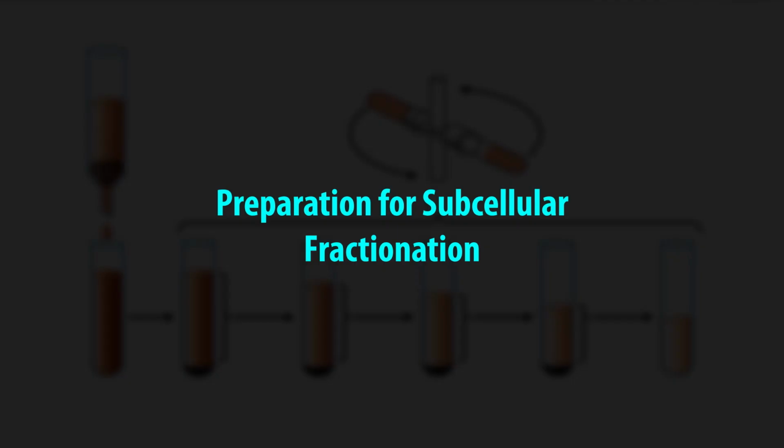Each fraction is enriched in a particular organelle or molecule. By analyzing these fractions separately, scientists can pinpoint the location of enzymes, proteins, lipids, or nucleic acids in the cell.